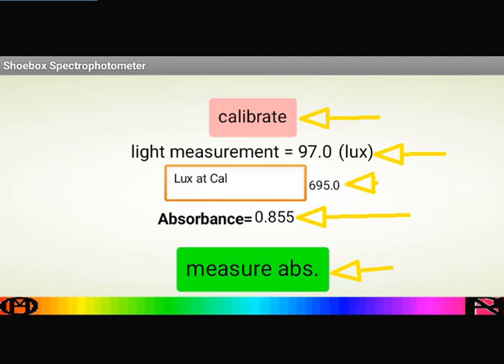510 and 630 nanometers. And I've got R-squared values which are about as good as a lab spectrophotometer. So they're all over 95%, 0.95 as an R-squared value from my calibration graphs I've made.